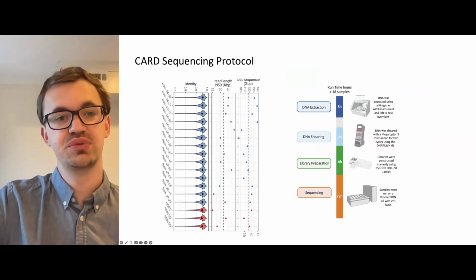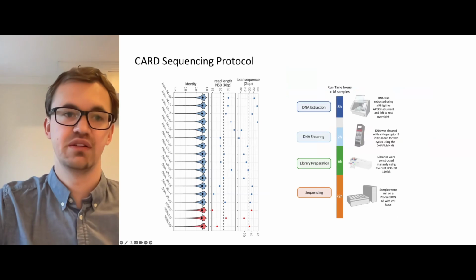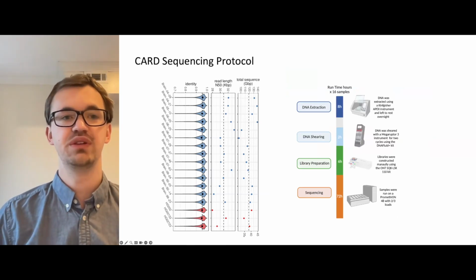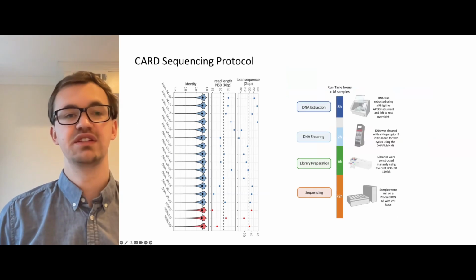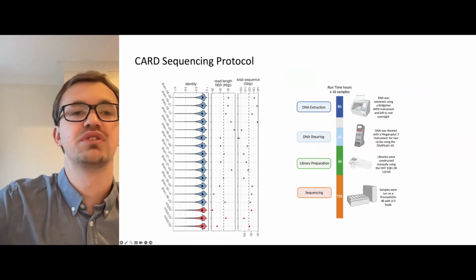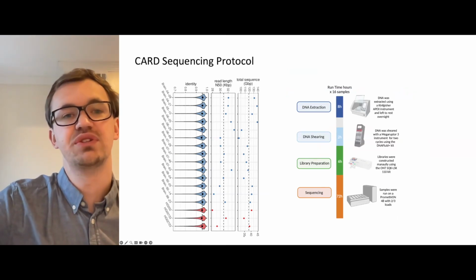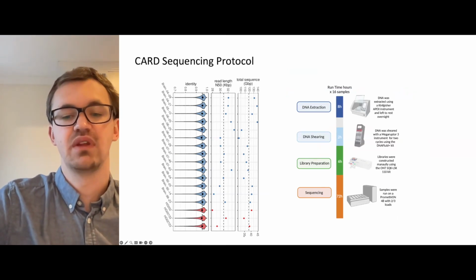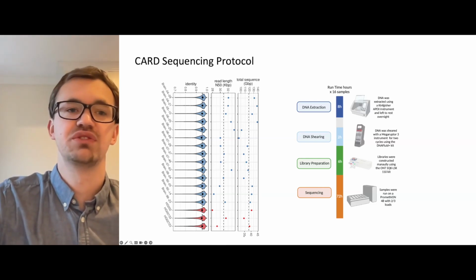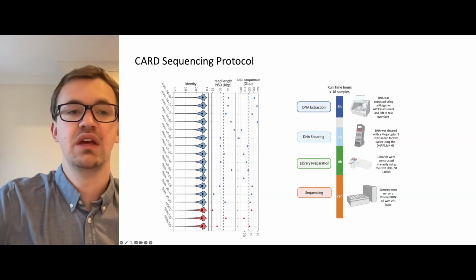the goal was to use a single flow cell per sample so that we can really scale it up. And we have a little bit of trade-off between the yield and the read length. So what we settled on was a yield at around 30 to 40x, which translates to about 100 to 120 gigs of data, and the read length N50 about 30 kb.